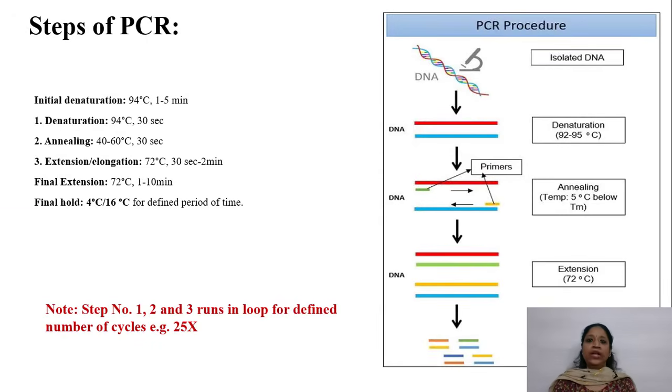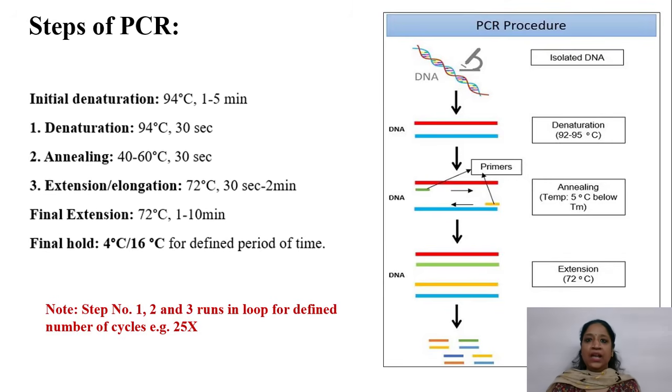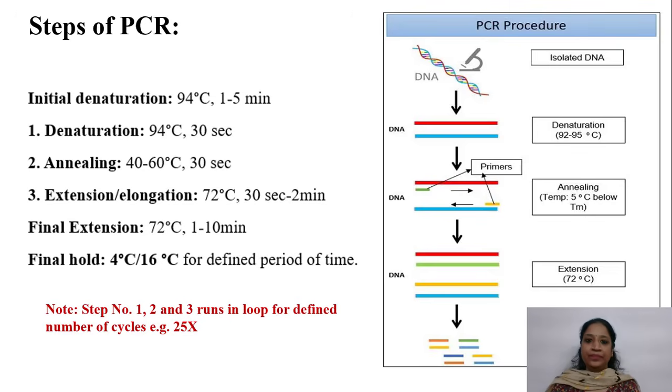Now, let's get into the actual reaction of PCR, but I'll keep it simple. PCR works by taking advantage of the natural process of DNA replication, but it supercharges it in the lab using specific tools and controlled conditions. The process has three main steps: denaturation, annealing, and extension. During denaturation, the double-stranded DNA is heated to separate it into single strands. Think of it as unzipping the DNA molecule.